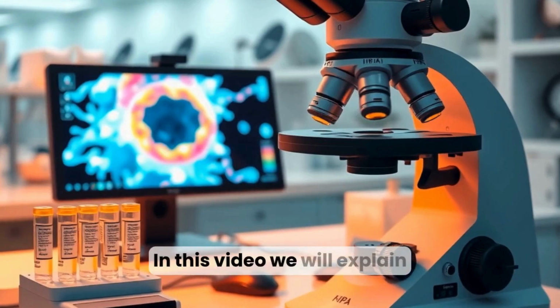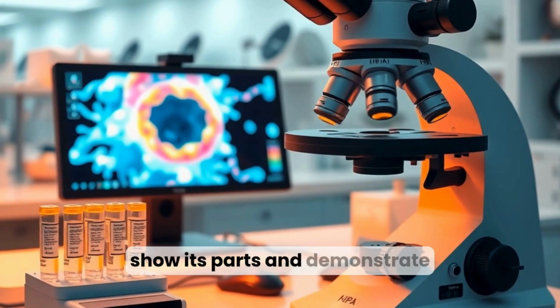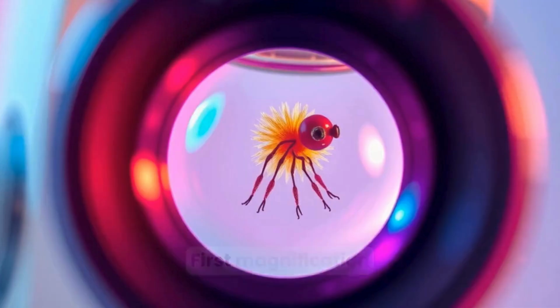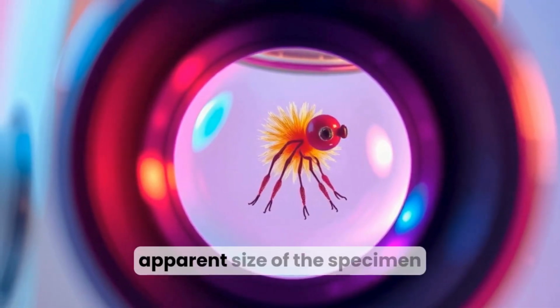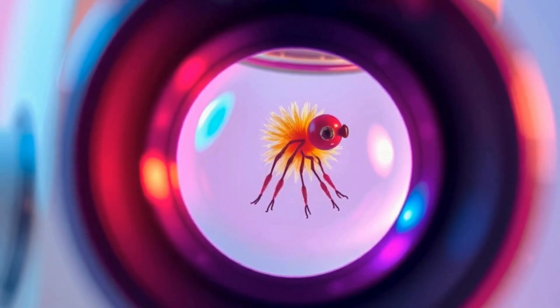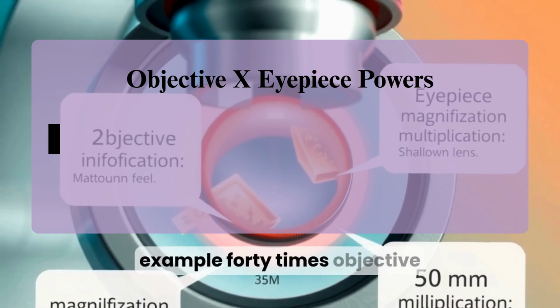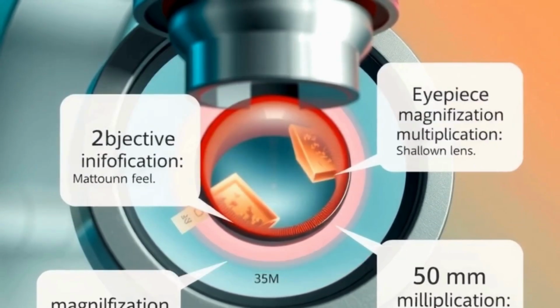In this video, we will explain how a light microscope works, show its parts, and demonstrate magnification, resolution, and visibility with real slides. First, magnification. Magnification enlarges the apparent size of the specimen so small features become visible. We describe magnification as the product of the objective and eyepiece powers, for example, 40 times objective times 10 times eyepiece equals 400 times.